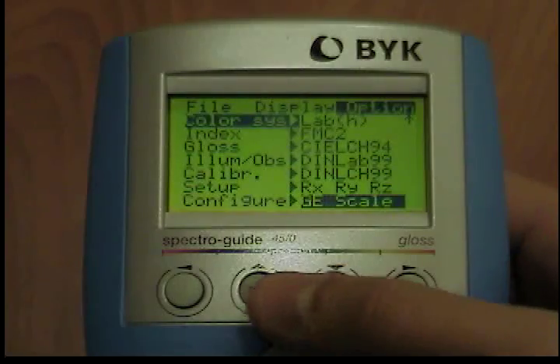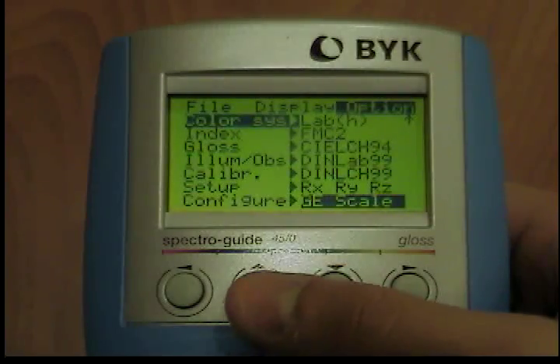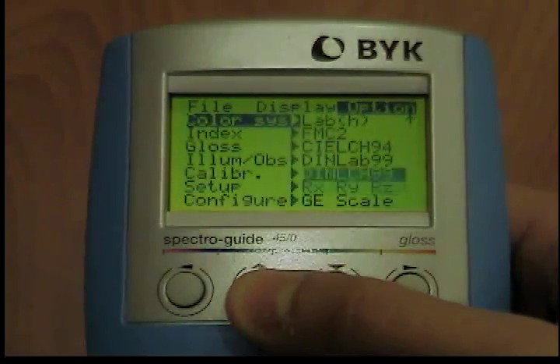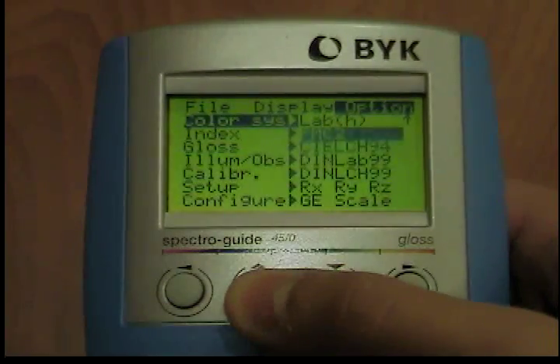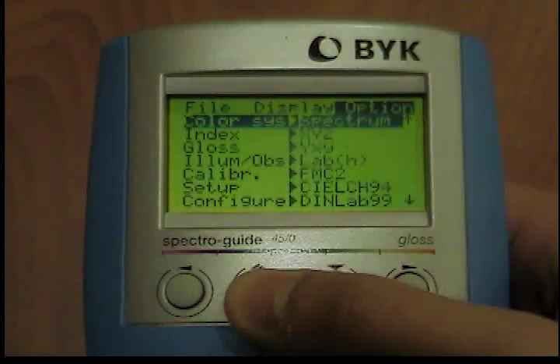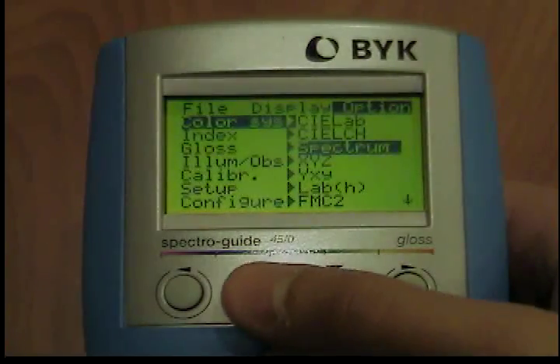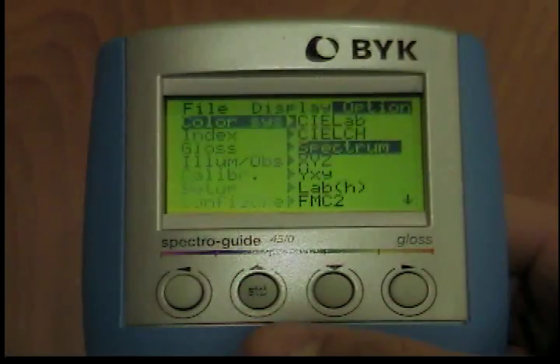The instrument will then return to the previous measuring mode and the chosen color system will be shown in the display. You can also use the keys to exit the submenu without changing the color system.